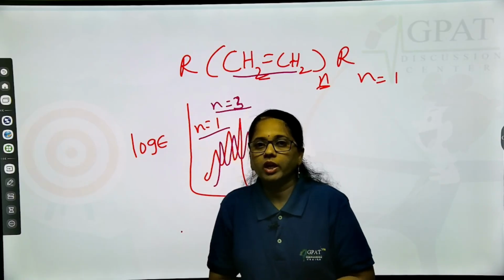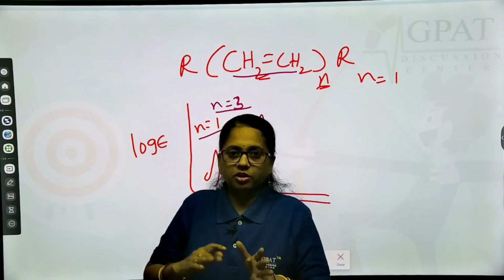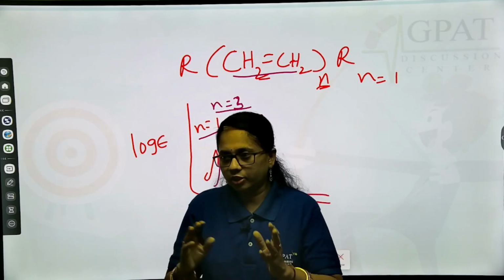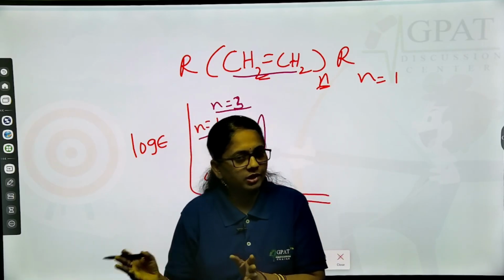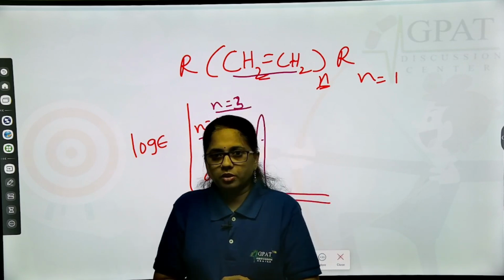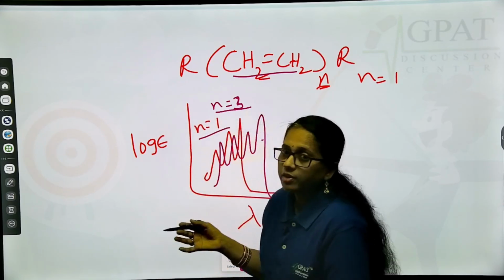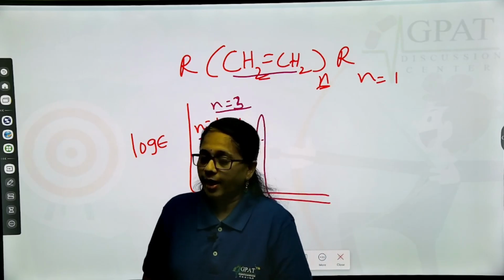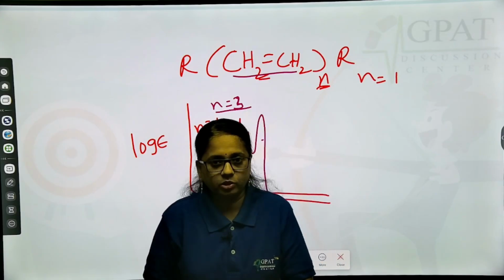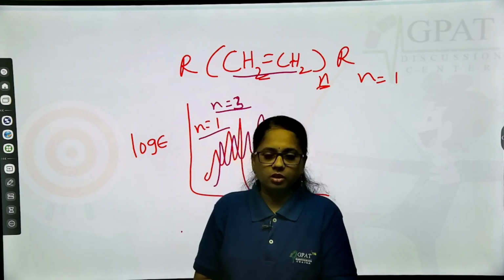In this way these absorption bands are helpful, because generally in UV spectroscopy at the molecular level, if you know about the electronic transitions, sigma to sigma star and n to pi star, all these transitions give you an idea at which wavelength you are going to estimate the compounds quantitatively and qualitatively. But knowing the significance of these absorption bands gives you the importance of the conjugation. Thereby it will help you in the structural elucidation of the compounds, right.